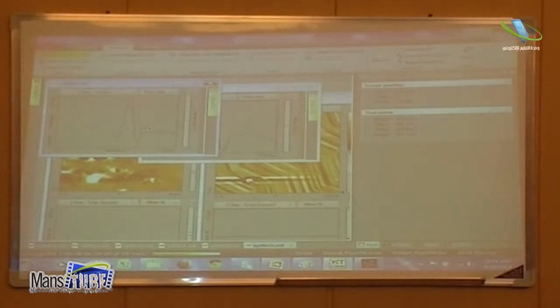If you look for the depth, maybe we can measure. I'm not sure how much we go down, but this is like 40 nanometers in the material, in that example. But we have up more than 40. I don't know how much you remove. Here we have like 80. It depends how the tip acts with the material.